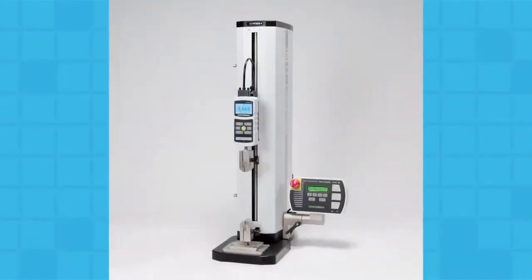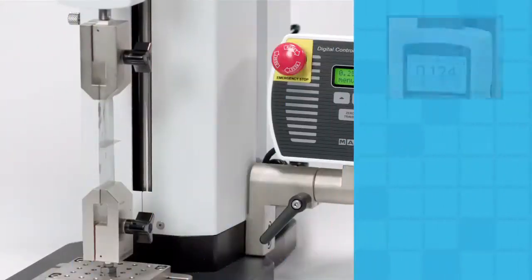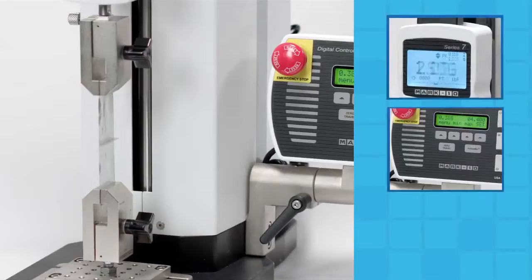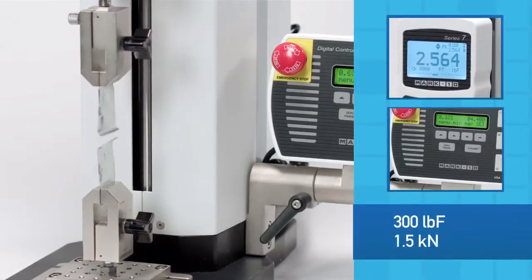Welcome to the Mark 10 ESM 303 Force Tester. The ESM 303 satisfies tension and compression applications up to 300 pounds or 1.5 kilonewtons of force.